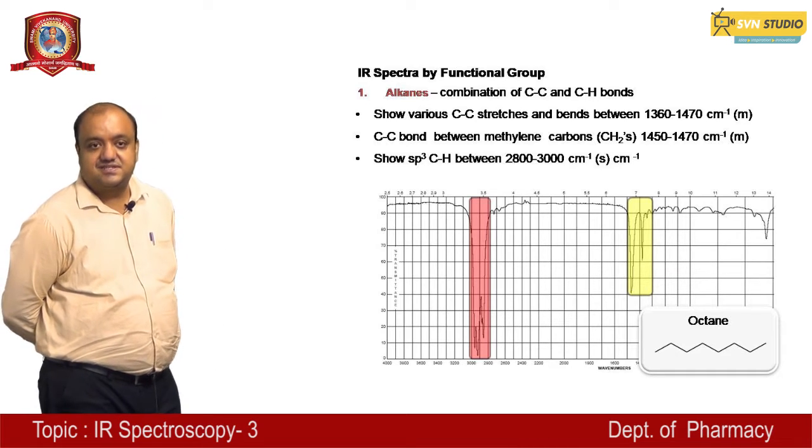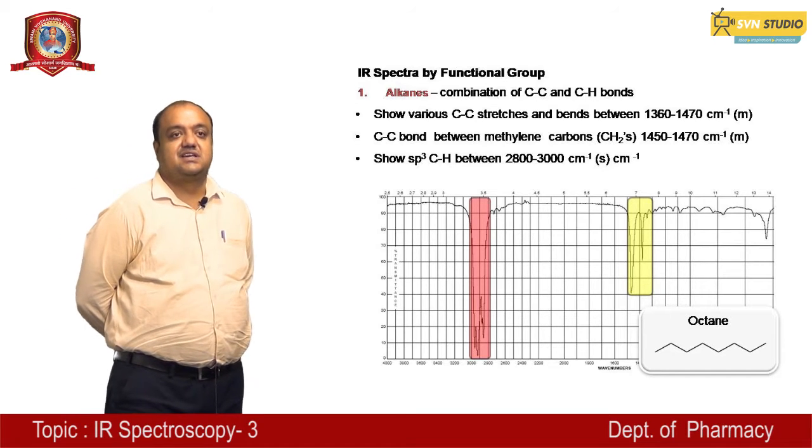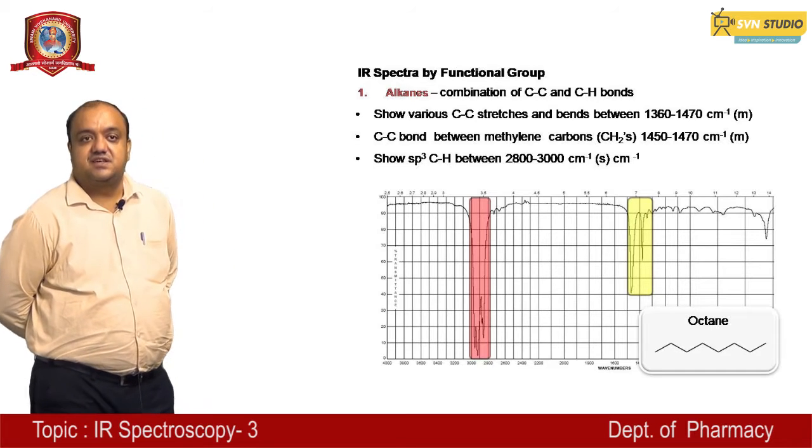It is the example like octane, which shows the alkanes and C-C and C-H bonds and their absorptions.